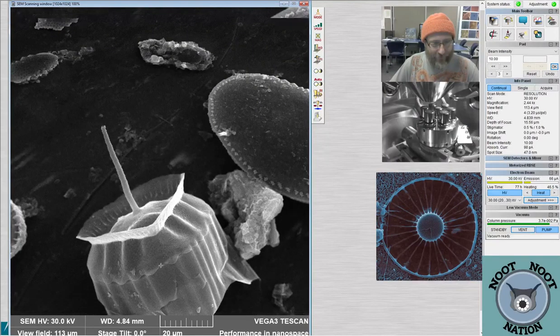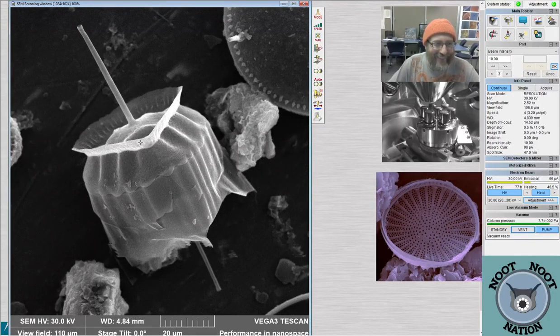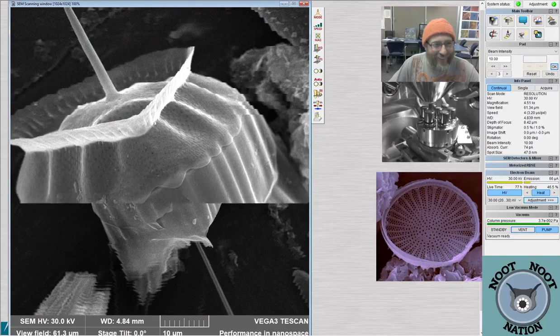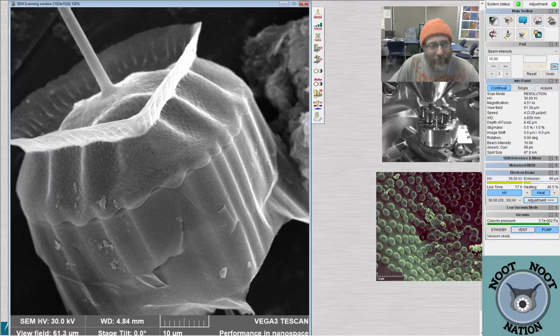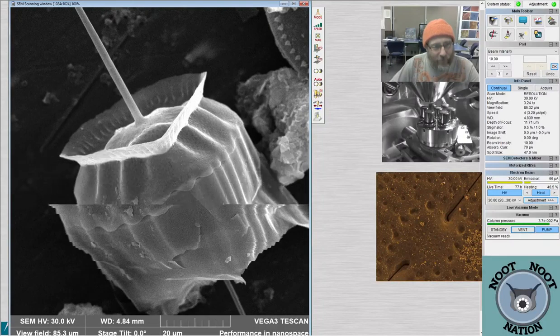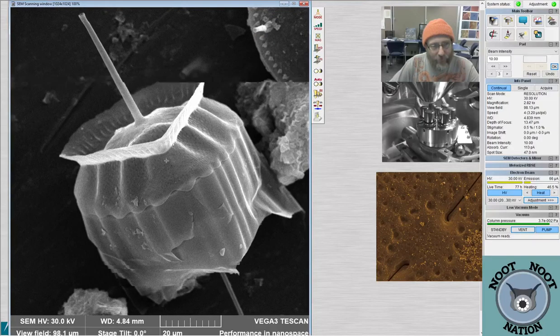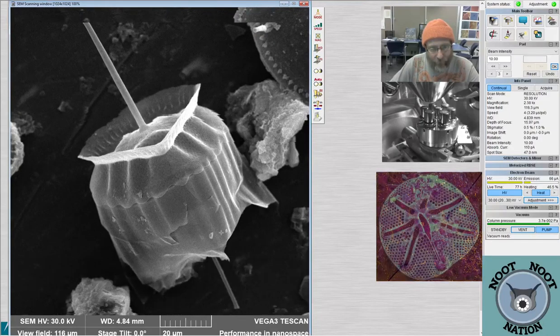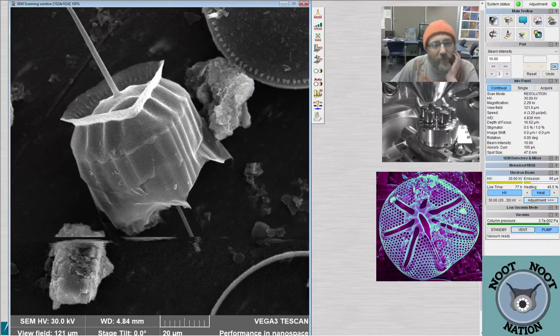Hopefully Pacific Plankton is still in the channel somewhere because I found it and I told you I would. And you see how it just has like a skirt? It doesn't have the little spines on the outside edge. And the valve looks a little bit different too. So this is the Ditylum I was thinking of. And normally there's like an eyelash-like structure around here, but this one does not have that, and it's the whole valve. So this is a pretty interesting little guy.